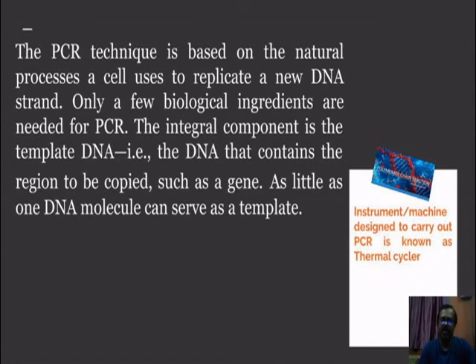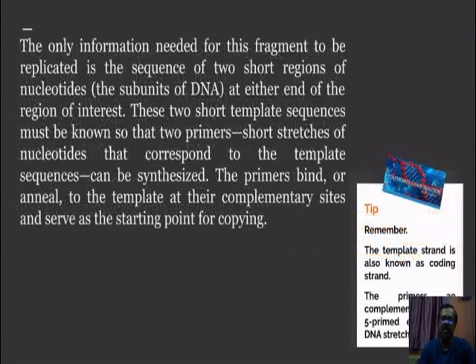So this sequence should be known. Then the primers are designed. Then the dNTPs, or the free nucleotides, are needed, and finally the DNA polymerase enzyme, which is very much essential.